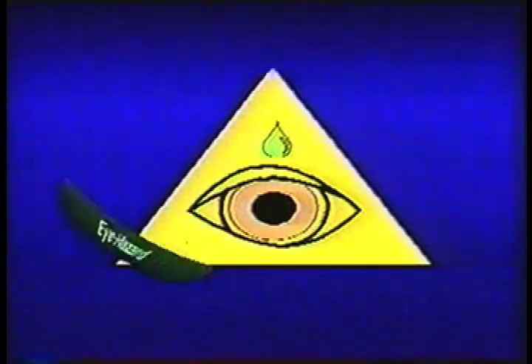A lightning bolt. Electrical hazard or sparks. Use particular caution when dealing with this electrical equipment. Eye hazard means you need to be careful of flying objects or splashes. Use eye protection whenever you see this. Goggles.